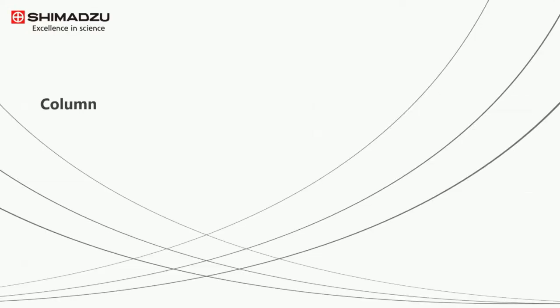The next step in the GC flow path is the column. Selecting your column can be one of the trickiest things to do. Unlike the inlet, you can't simply change the column at the press of a button. A typical column can cost somewhere between £300 and £600. So it's important to select the correct column first time. There are two main decisions to make: what dimension and what stationary phase.